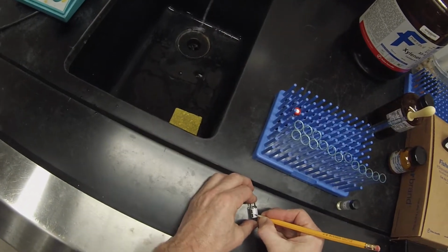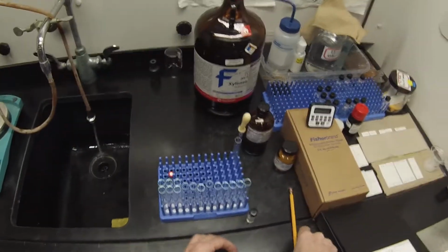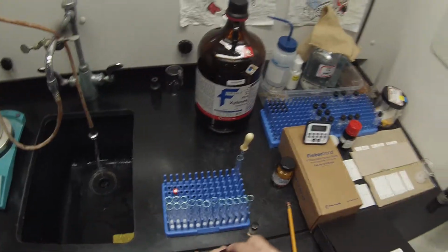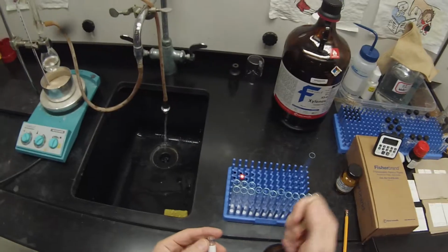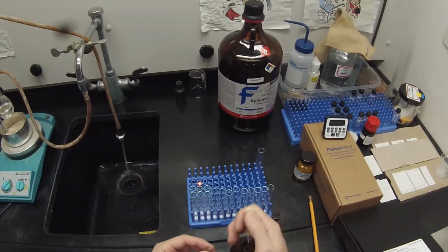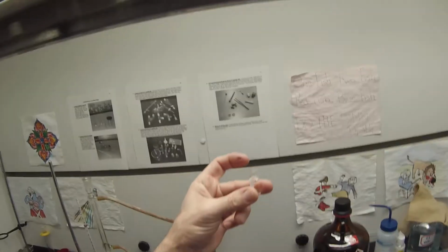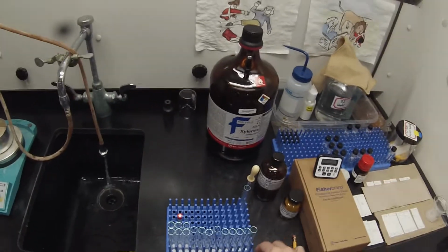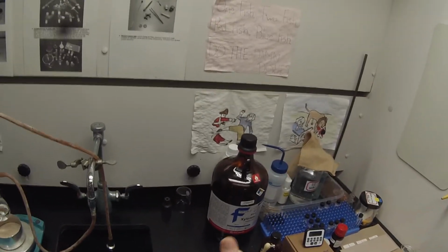So I'm going to grab this whole set of mass spec vials. We've got 52A. Grab another pipette. This sample is way too concentrated for mass spec. Mass spec is much more sensitive than TLC. So again, I'm going to fill that to the second line, maybe a little more. About halfway between the second and third line. Dichloromethane. And then just add a little bit of the ethyl acetate solution of 52A.